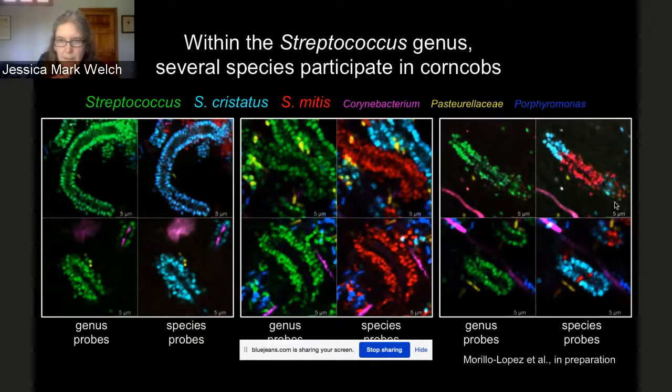But you can collect a sample from an individual that has none of that and instead has a variety of other little cocci piled together. There are some samples that are almost entirely hedgehog structure, and there are others that have very little. So there is a lot of variability. Corn cobs, similarly, I would say pretty much every plaque sample that we've looked at has at least something that's corn cob. But again, sometimes in very high abundance, sometimes in much lower abundance. It's like wading into the jungle and trying to characterize exactly what you see. Yeah, it's complex. Right, that makes sense. Okay. Yeah, but it's a great question.